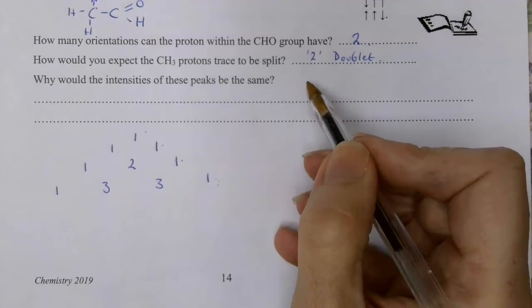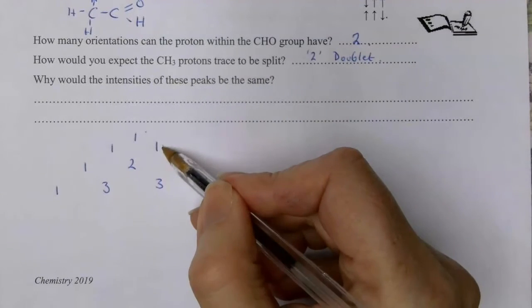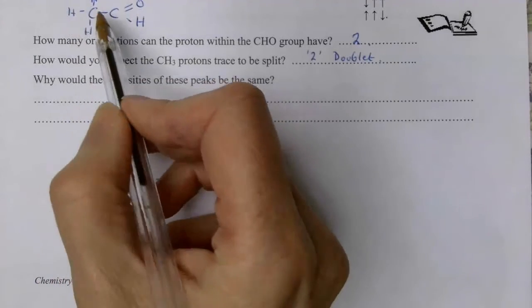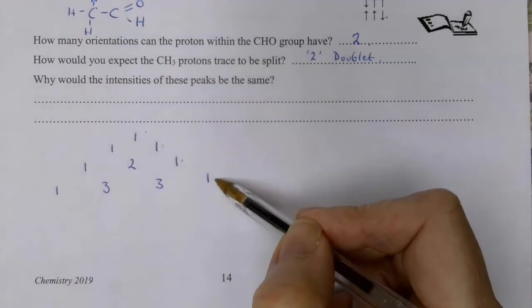So would the intensities of the peaks be the same for the doublet? Yes, they would, because they're single heights. But for the quartet, they would be in the ratio 1 to 3 to 3 to 1.